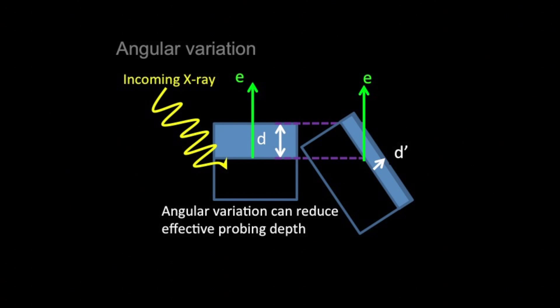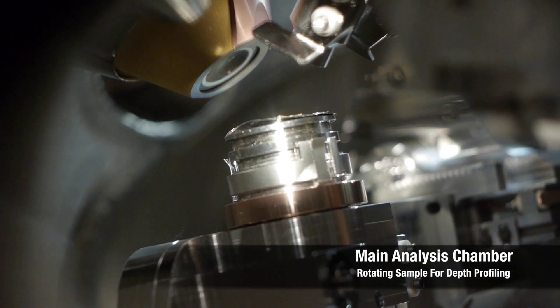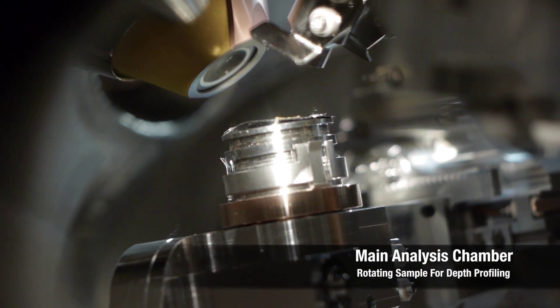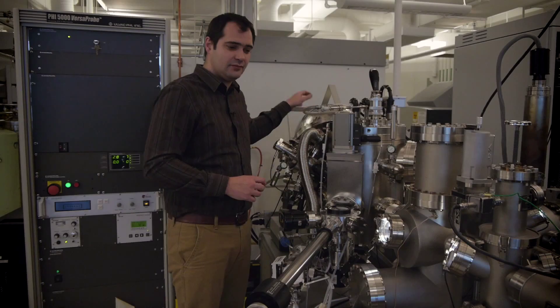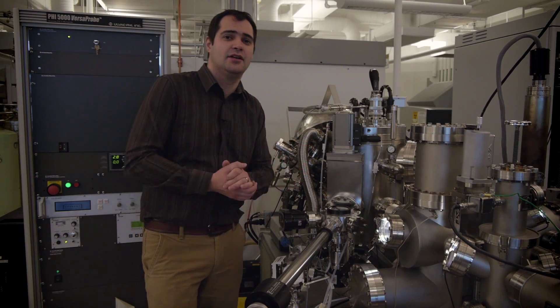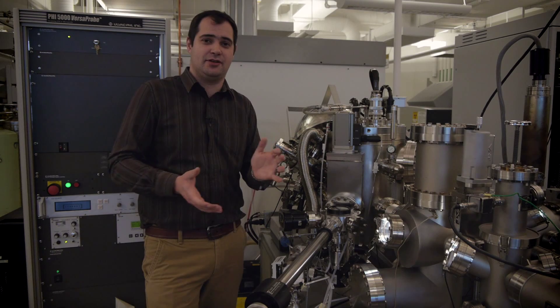We're going to move the sample to a different angle, which will allow us to get a kind of depth profile from our sample just by changing what angle the X-rays come in at. This can tell us quite a bit — as I mentioned, we use this for chemical analysis.